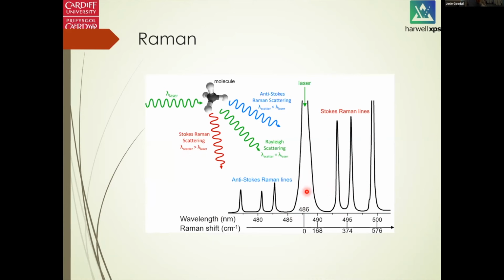And what we always see from a Raman spectrum is actually half of the spectrum, because the anti-Stokes Raman signals are attenuated, and the Stokes Raman lines usually give us the high intensity and help us to identify the molecular vibration or rotational or other low frequency modes of the molecule.